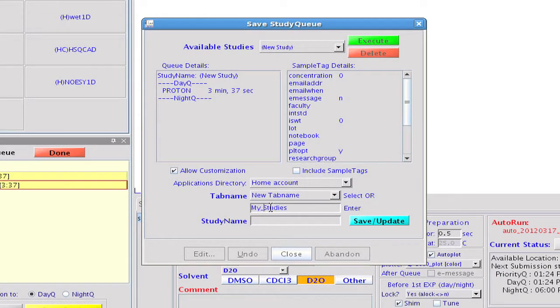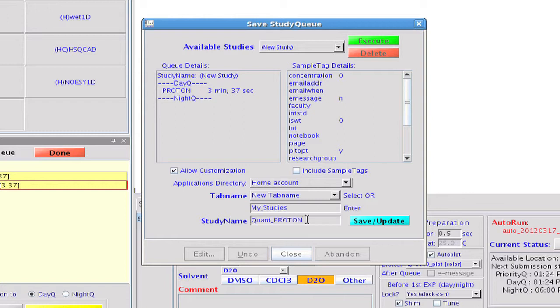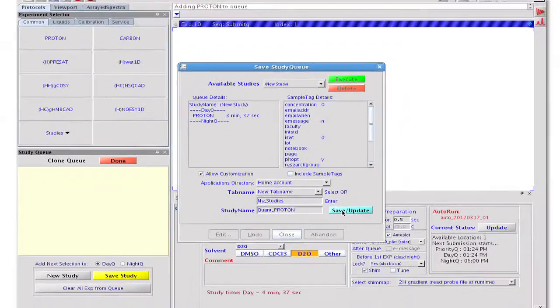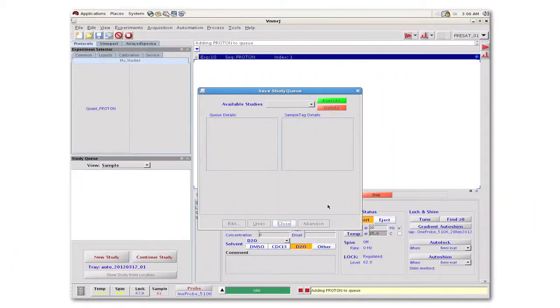We'll use the tab name pull-down to create a new tab called my studies and enter a name for the new button in the experiment selector such as quant proton. Using the save update button now creates our new tab in the experiment selector and adds the quant proton button to that tab.